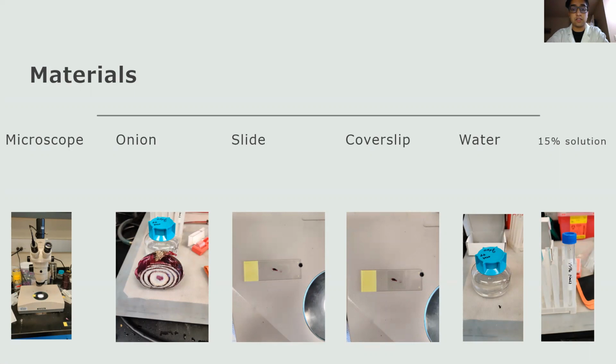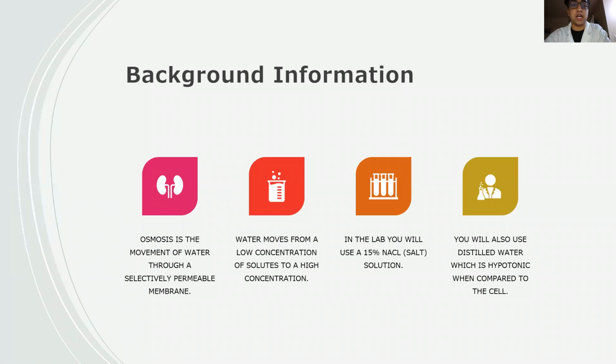And then you're going to obviously be needing your solution. So we are first going to be using distilled water, which is one of our environments we're going to be looking at, and 15% salt solution. And then we can look into some background info real quick.